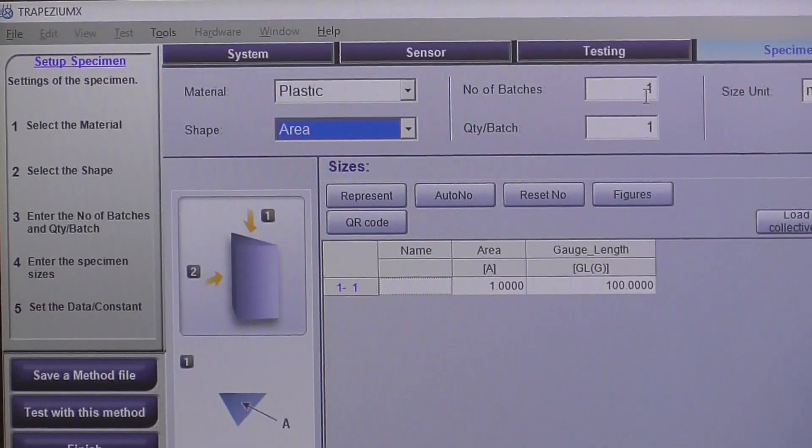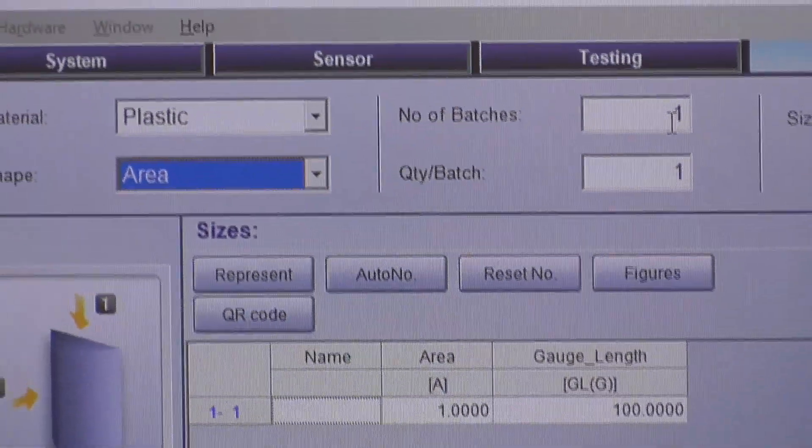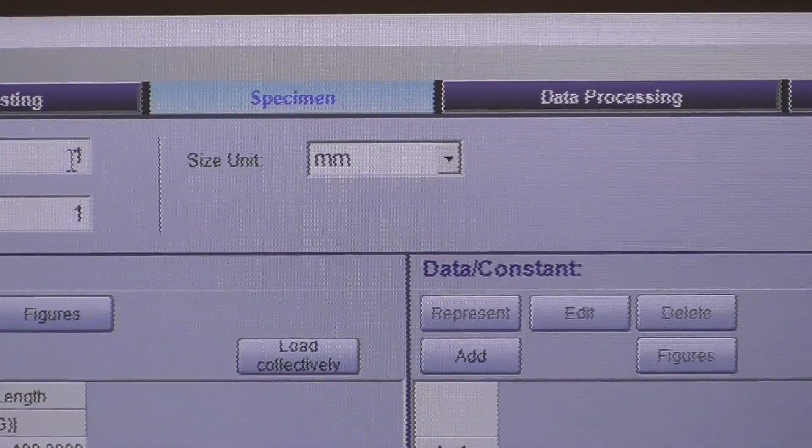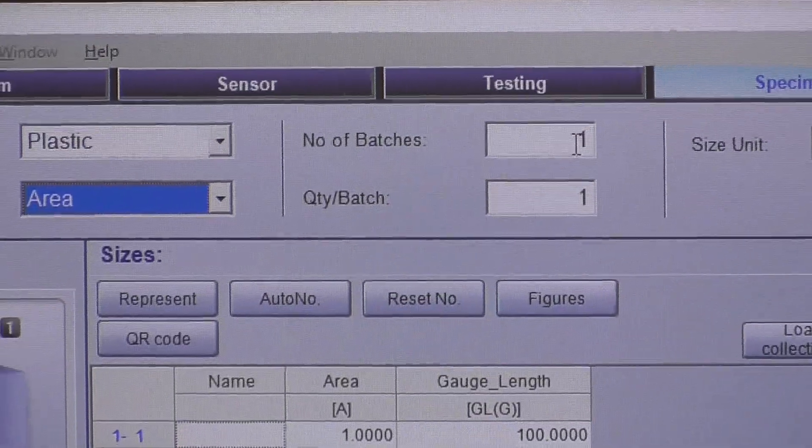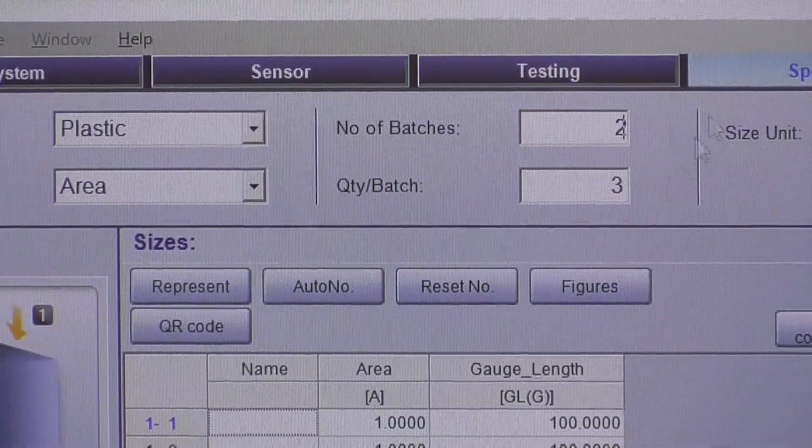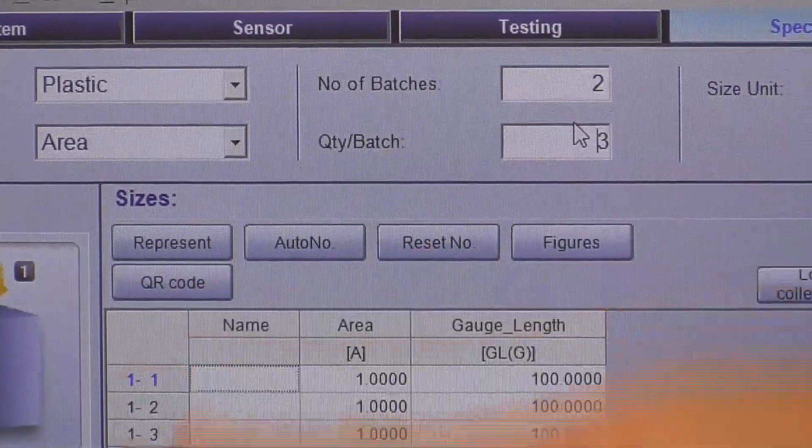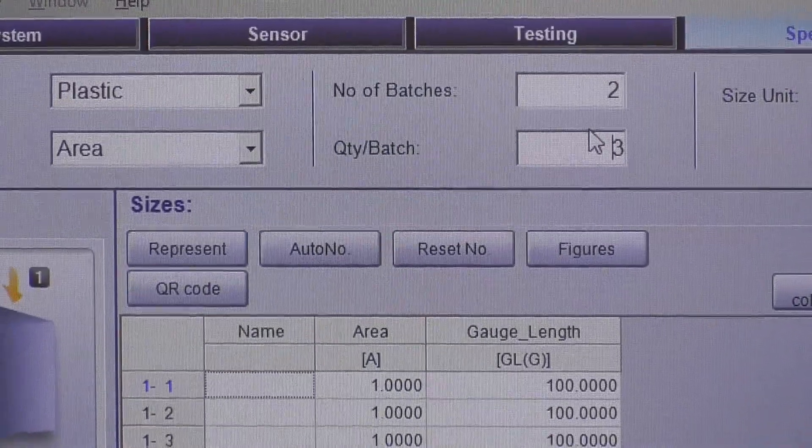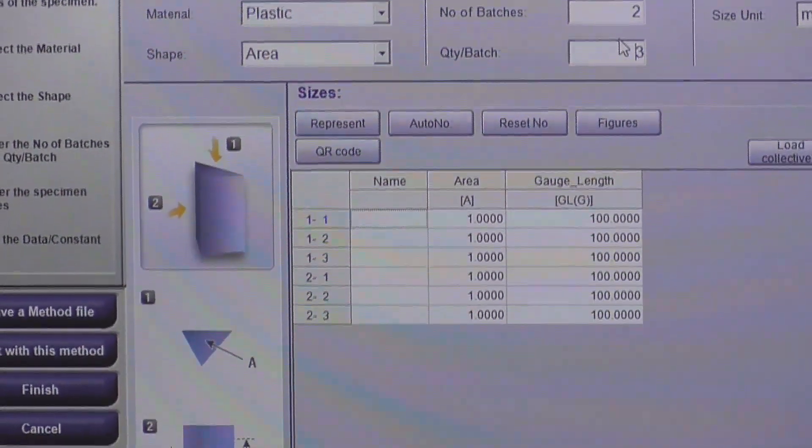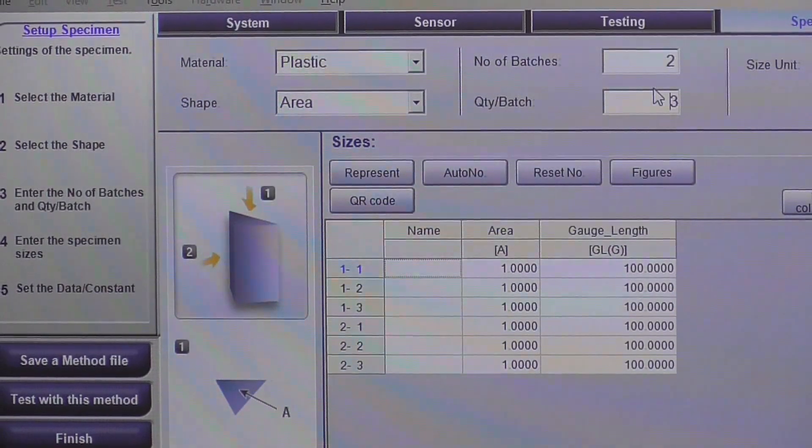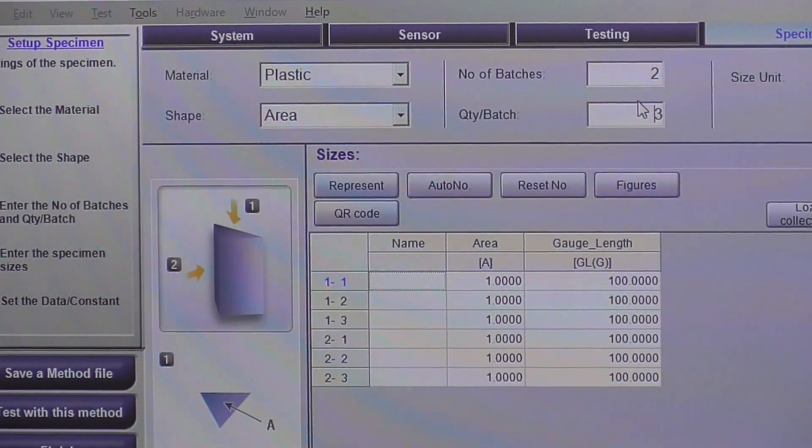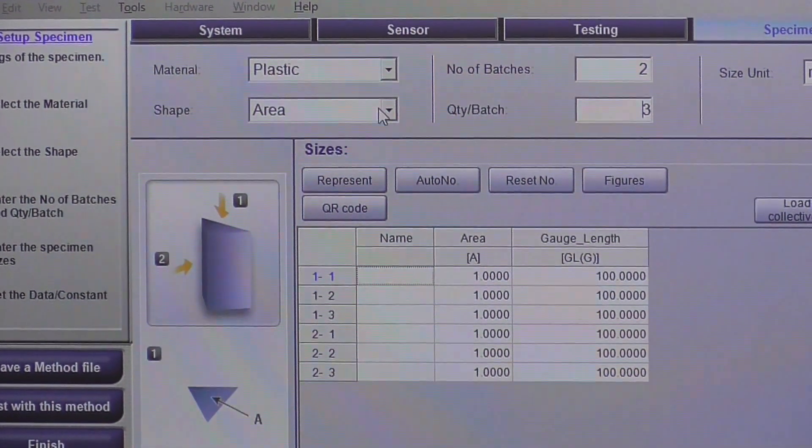Also in here you put the quantity of samples you want to run per batch, and also the amount of batches you want to run per sample. So let's just say you have two different sample sets you want to run, and you have three of each. Quantity per batch three, and we have two batches. So that'll kind of populate the type of samples that we have here. We can name the samples different things. They're auto-named by their batch and sample number. And you can also enter in the dimensions of the samples in this area too. You can enter them in later on as I'll show you, but if you kind of know the sample dimensions ahead of time, you can enter them in here.